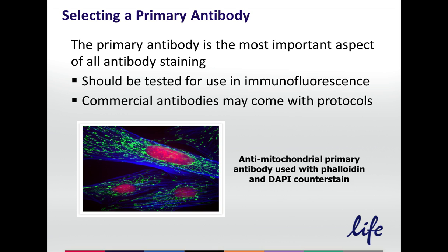So there's a lot of different concerns, and I covered those mainly in the first webinar in this series at the end of last year, which you can still find online and can register for and view online at the same site where you registered for this one. Okay, continuing on. Let's go on into the different labeling strategies now for how you can detect your antigen.